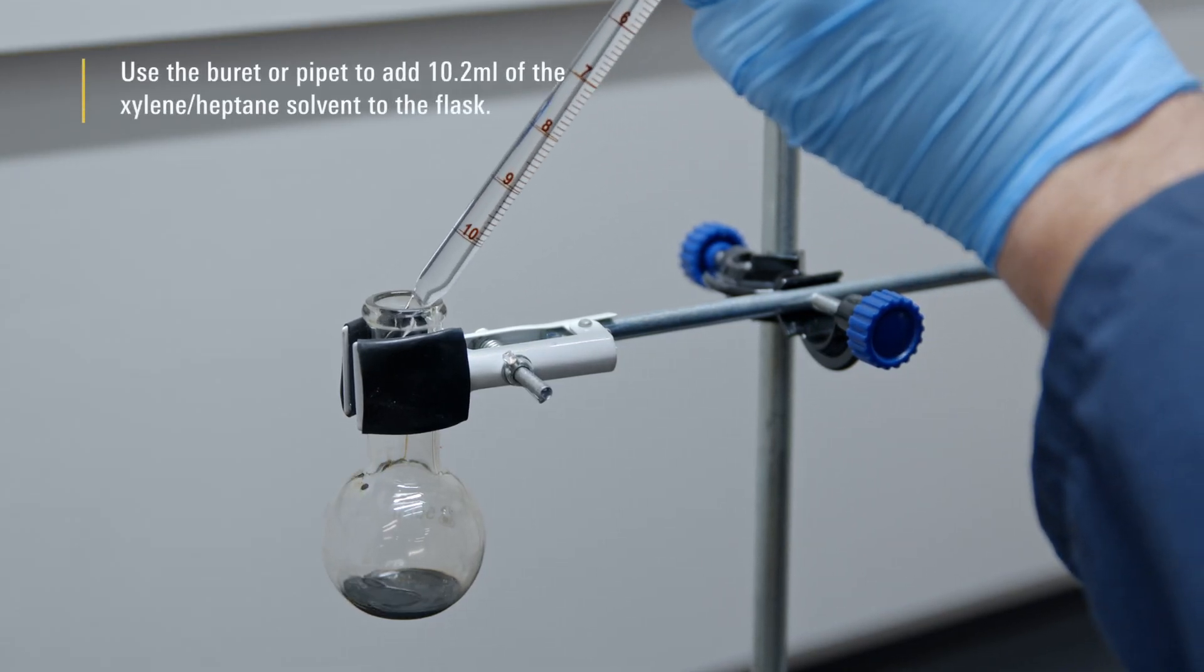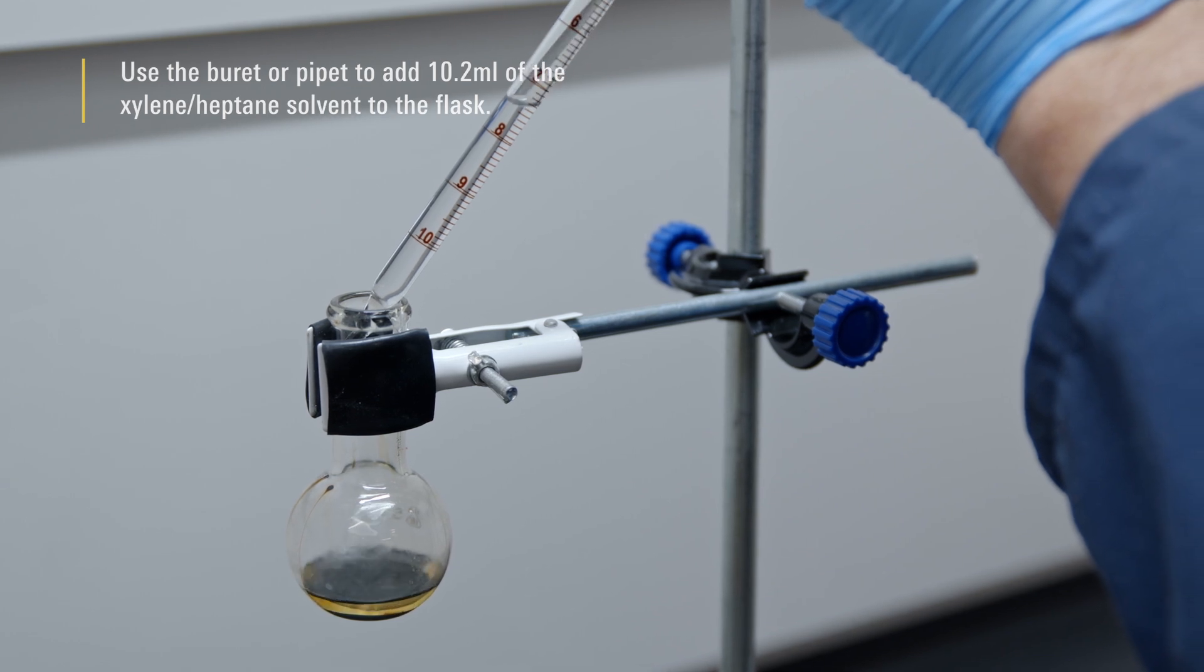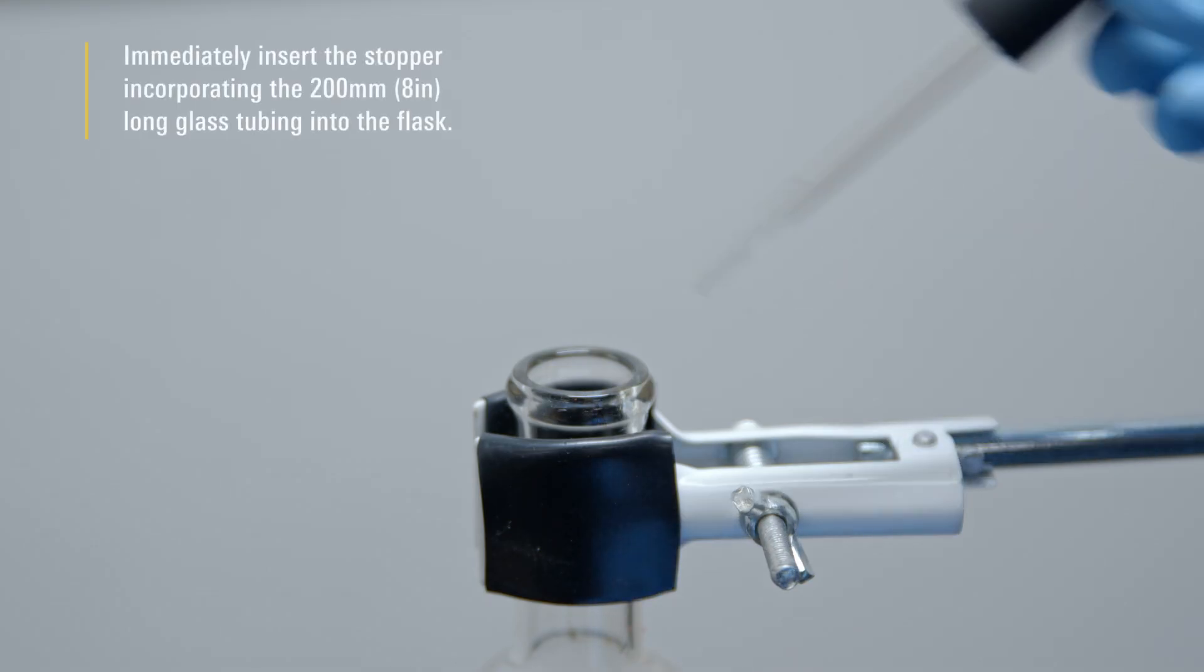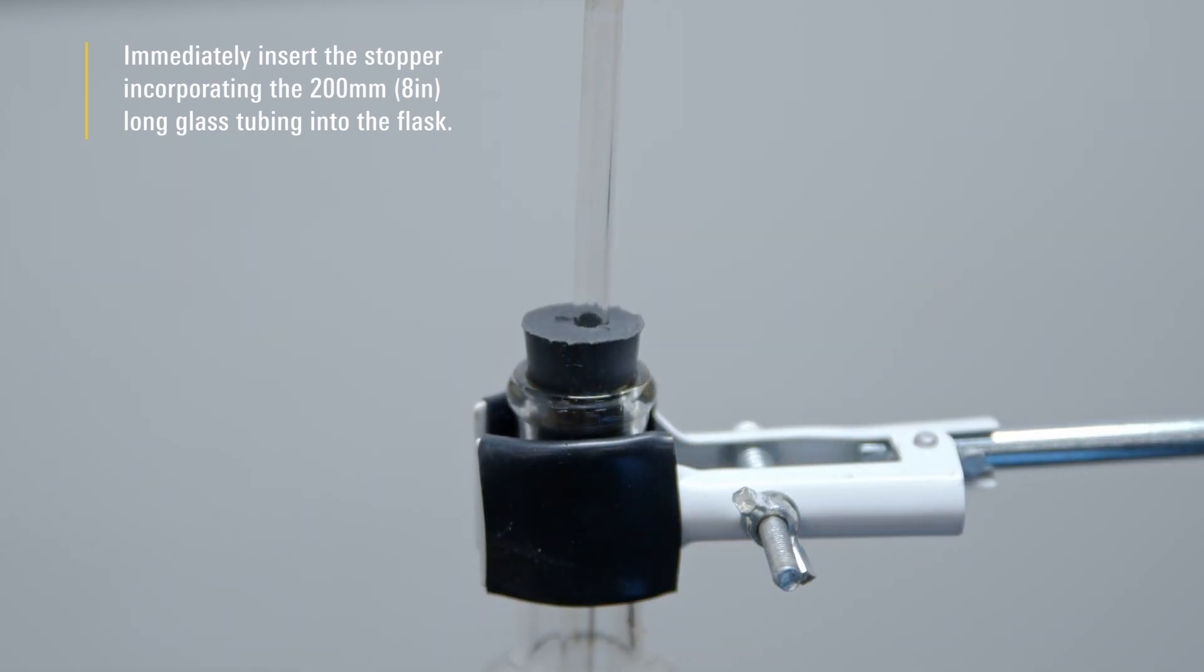Use the burette or pipette to add 10.2 milliliters of the xylene heptane solvent to the flask. Immediately insert the stopper incorporating the 200 millimeter long glass tubing into the flask.